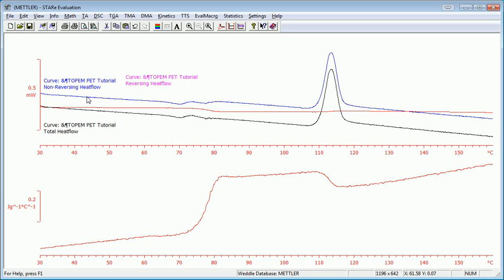The non-reversing curve and the total have some relaxation events near the glass transition. And the non-reversing also shows up completely the cold crystallization peak.